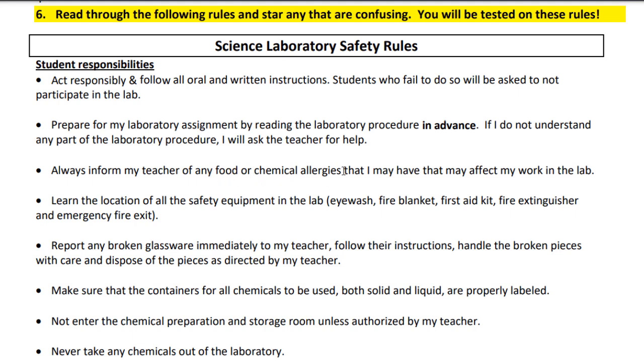Sometimes you don't mention it because maybe it's hay fever or something, and we don't need to worry about that. But if you've got a food allergy to something unusual, like, I don't know, watermelon, that's kind of an unusual one that people don't usually get allergic to. Sometimes in some of the labs we might have some foodstuffs around, and I want to make sure that we're not exposing you to something that could hurt you, okay?